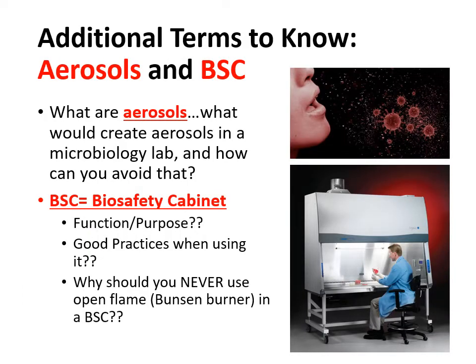So now the last thing I want to mention when it comes to lab safety are two terms I want you to be familiar with. They are aerosols and BSC. Now we already mentioned aerosols. That's a fancy scientific way of saying that a solid or liquid has basically become these fine particles that you can inhale. So whenever you're handling bacteria or any kind of sample with living organisms, you want to make sure not to shake or vortex them, because then you can create aerosols. You breathe in these fine particles and now you can become infected.